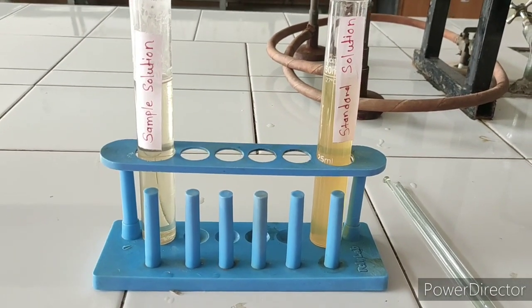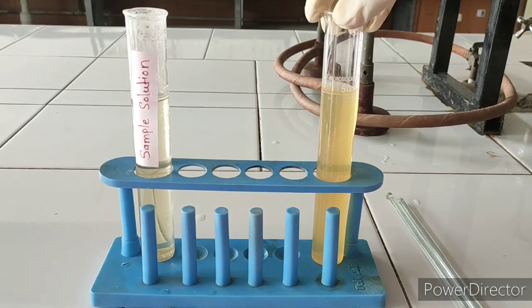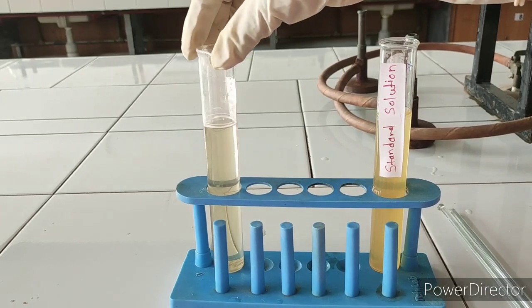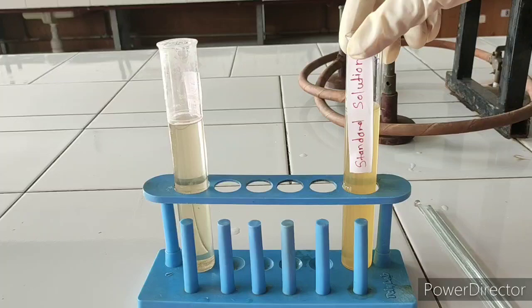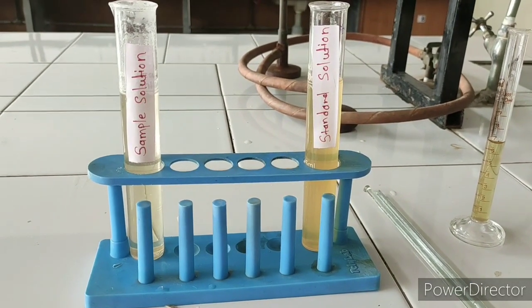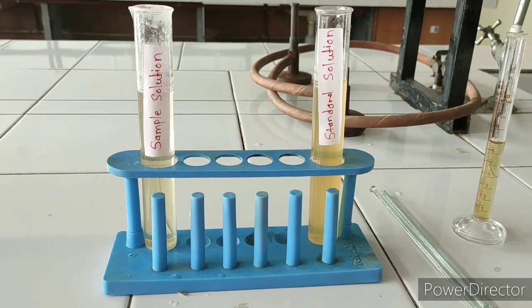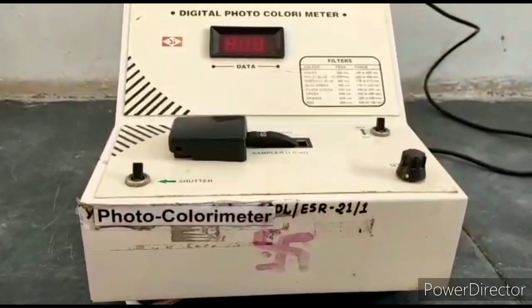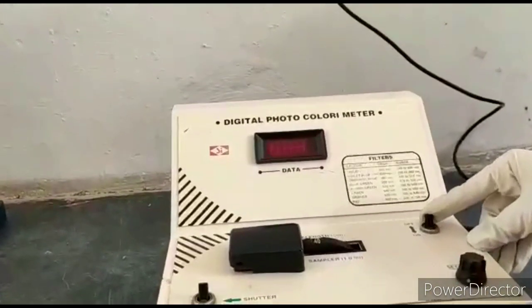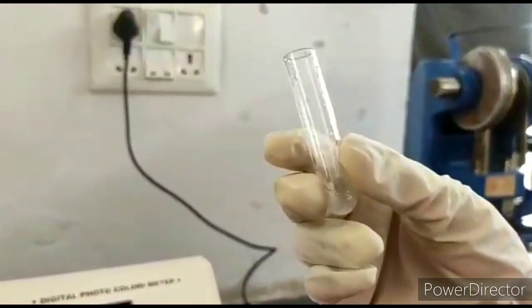Now the sample solution and standard solution are ready. Take readings on the colorimeter. You can observe that the color intensity of the sample solution is less as compared to the standard solution. Now we are ready to find out the suitability of dextrose.